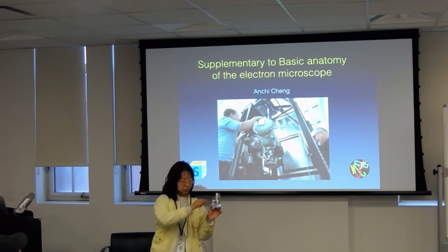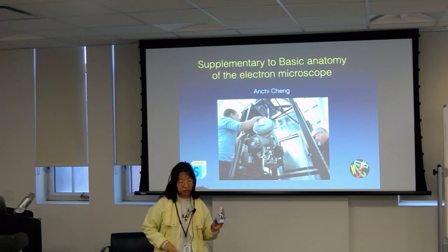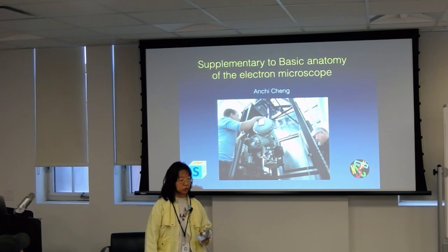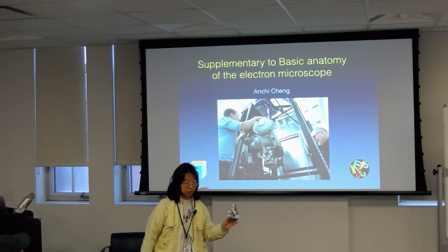Okay, so you can just imagine you have a light on there, make sure that it gets to the sample, and then from there on, you're going to make a good image. Then you watch it on a detector or binoculars.